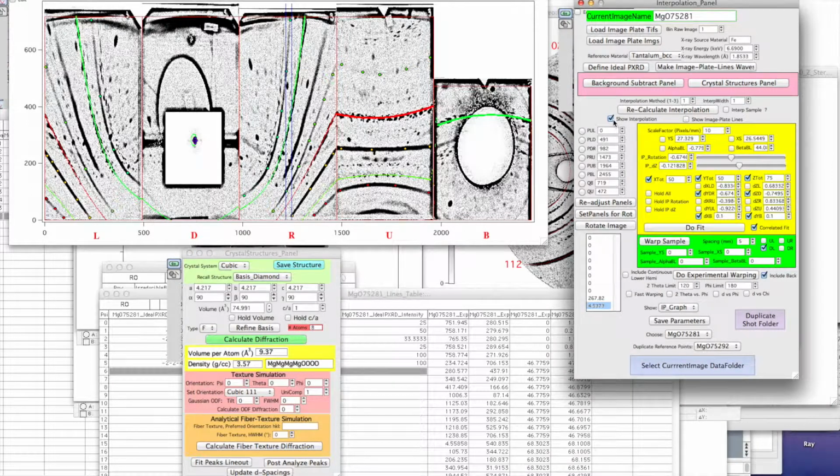And it looks pretty good, right? But there's obviously some lines that are not captured there. For example, this one here, and some of these, maybe this one here. I'm wondering, for example, is this line here driven, or is that due to the helium beta? Do you happen to know the helium beta of iron? Yes. Alright, what is that?